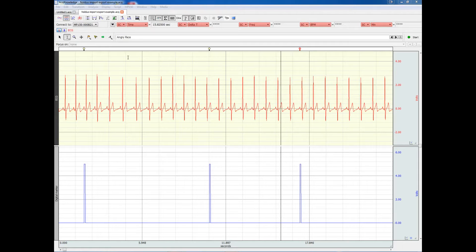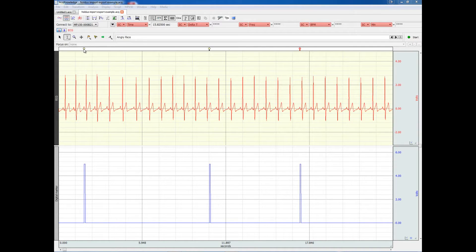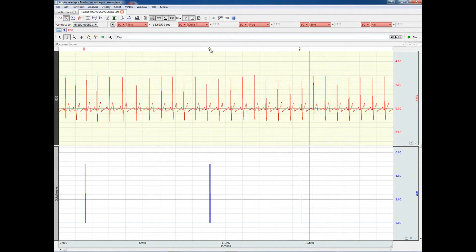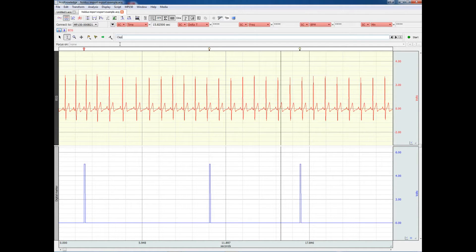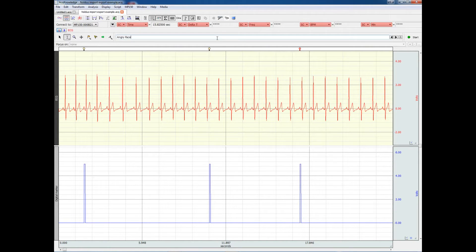Let's begin by demonstrating how we can export markers from ACKNOWLEDGE to the Observer XT. Here, on the top, where the global markers are, we can see three different stimulation event markers. There are CLAP, you can see the label here, HAPPY FACE, and ANGRY FACE.